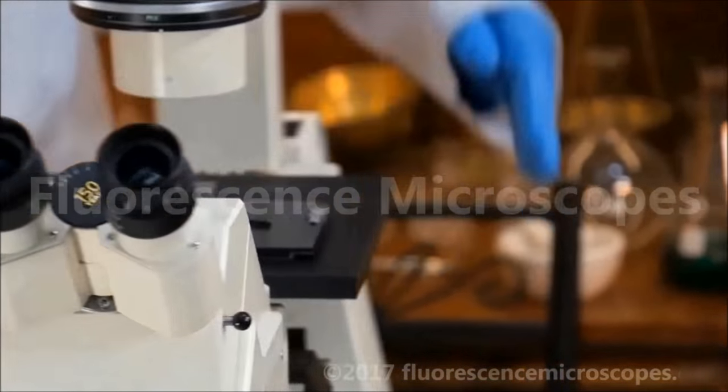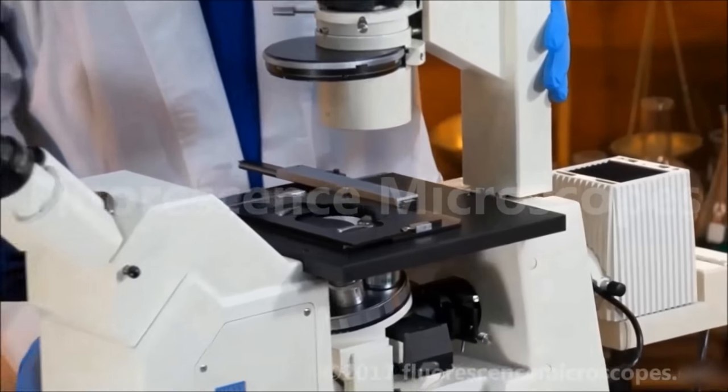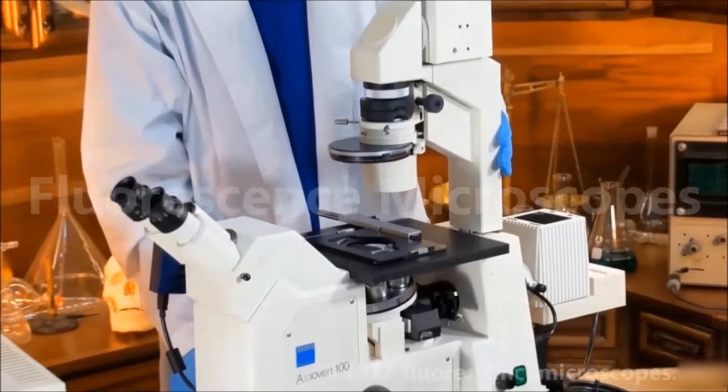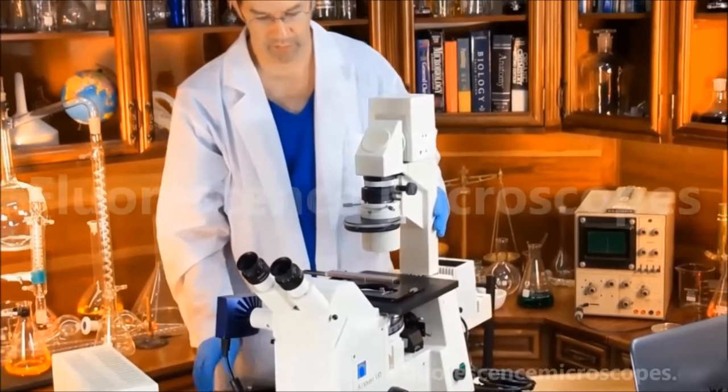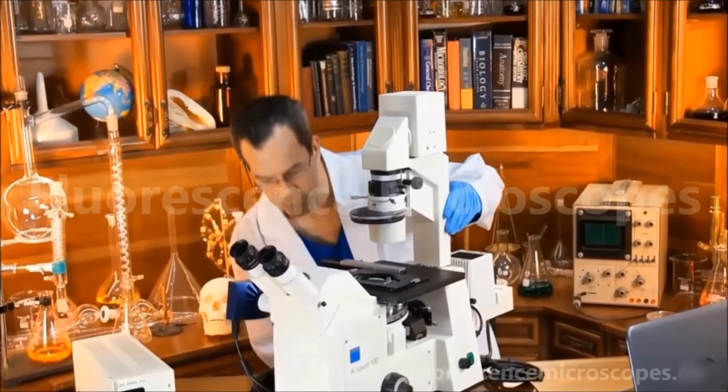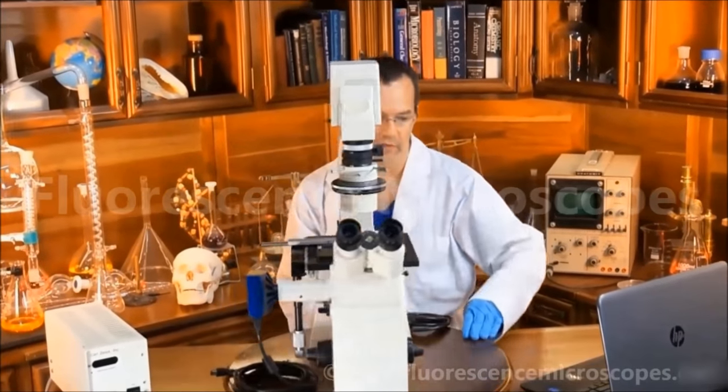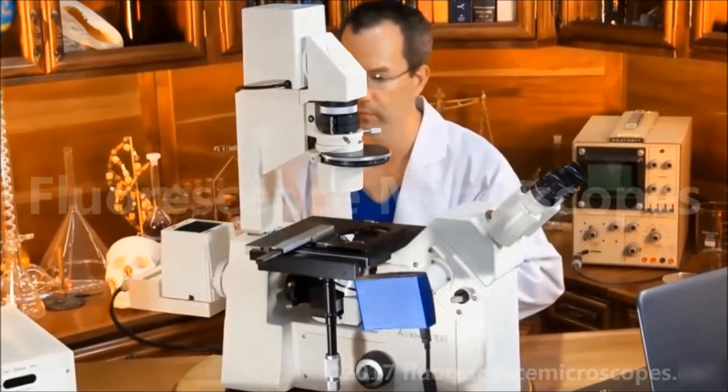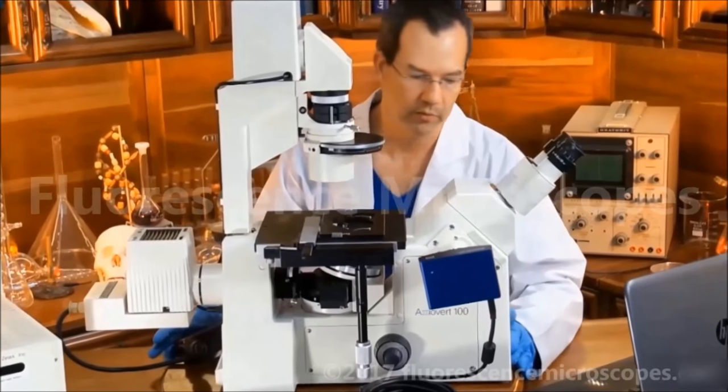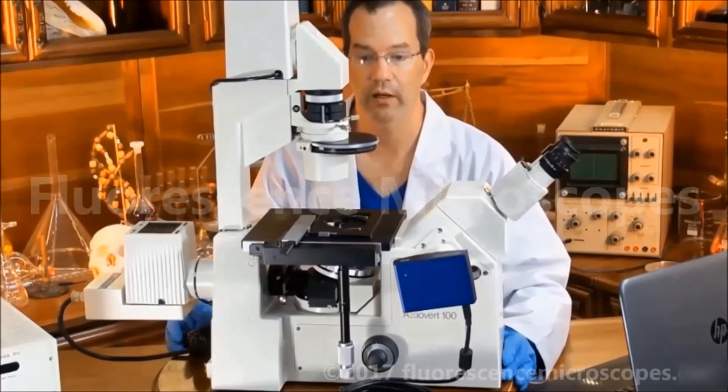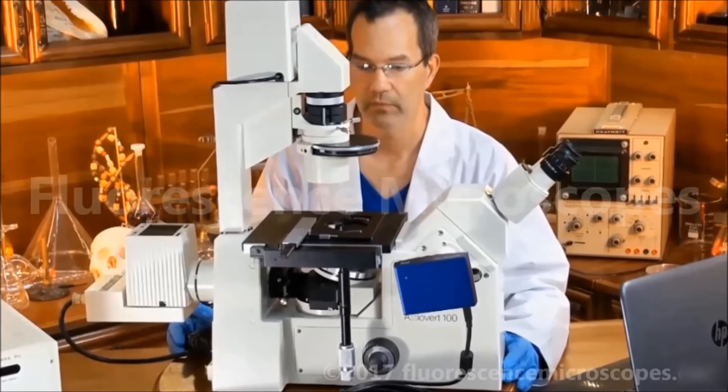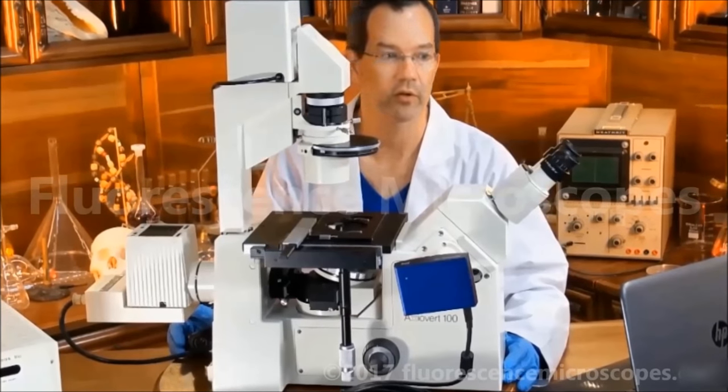This is a rather basic model microscope. It's not very complex, yet the price is relatively inexpensive compared to, say, an Axiovert 200. But this will get a good, decent image, certainly much better than you're going to get out of the cheap Chinese microscopes.